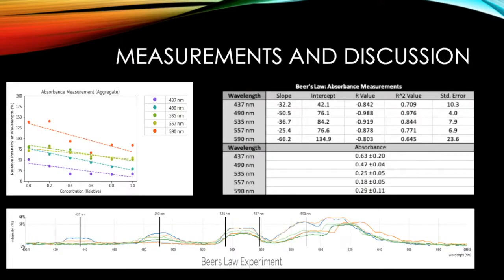Looking at images of spectra that were gathered alone, there seems to be 3 very easily discernible patterns. Without a doubt, as concentration increases, violet light gets absorbed dramatically fast. The cyan band additionally seems to follow this pattern, but remains visible much longer than the violet band. Lastly, there also seems to be a general reduction in light intensity across the entire spectrum. The numbers gathered seem to support this.